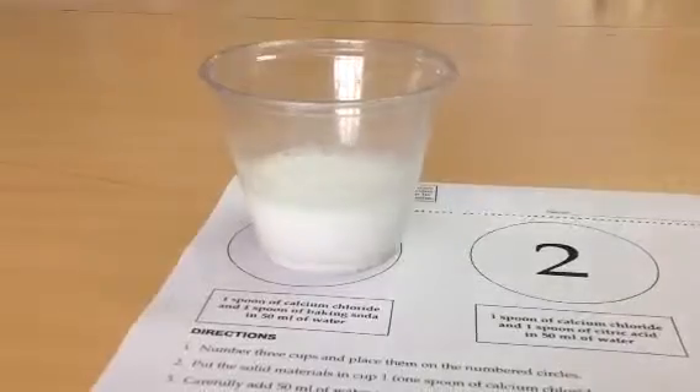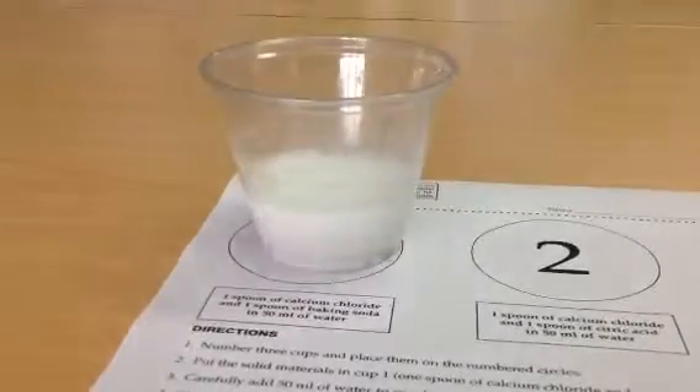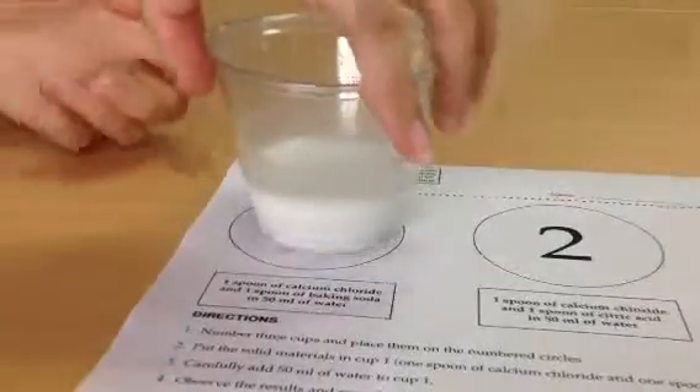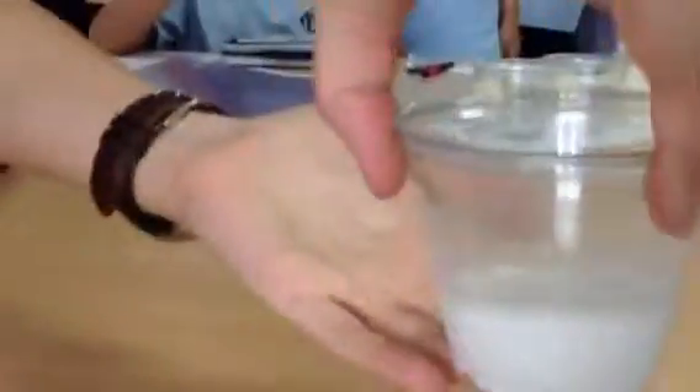Bubbles are getting up higher. Bubbles! Make sure he's coming. Lift it up, see if there's anything. It doesn't really feel like anything, but see if there's anything on the bottom. Cool, you have to take a look. I don't know if it's precipitated.